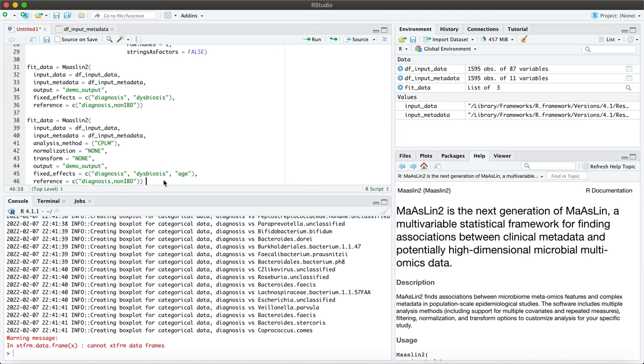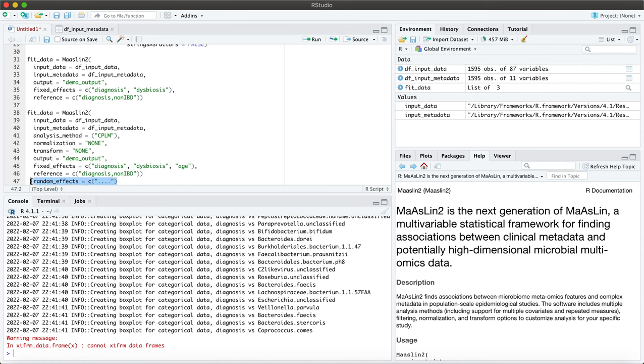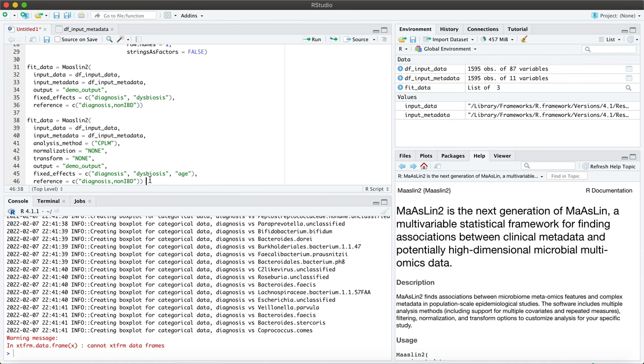And then one thing to note here is that you can also include random effects, so that would look something like random_effects and then you would list your variables here. For example, if you had a categorical variable with five levels, you don't have to specify random effects. You also don't have to specify fixed effects, you can leave this out, in which case it will run every column in your metadata as a fixed effect.